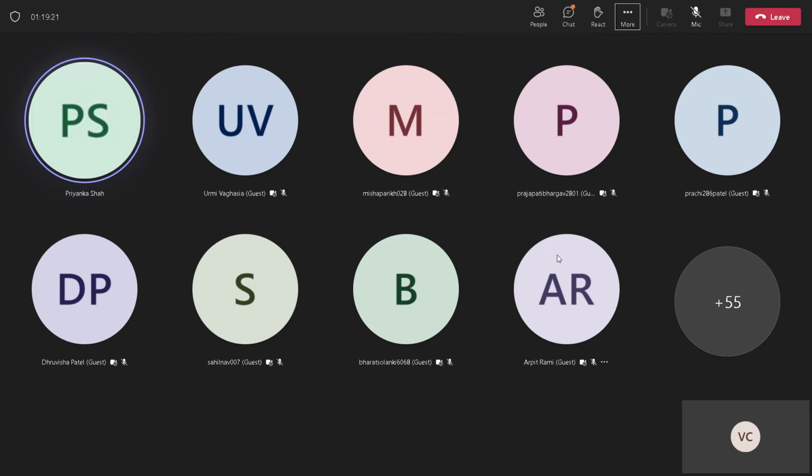See, so many questions can be asked from this. If you have an MCQ practical test, a question could be: if your compound is polar and your stationary phase is non-polar, and your mobile phase is moderately polar, which compound will come out first, or elute first, from the TLC plate?